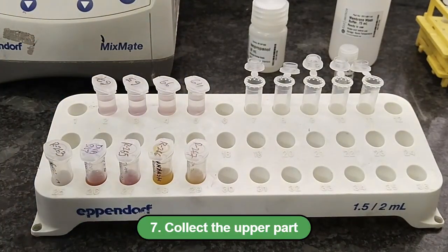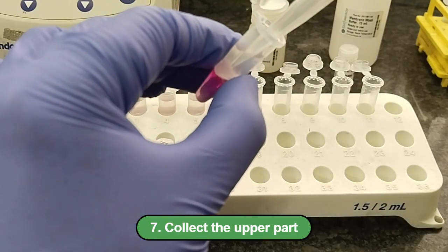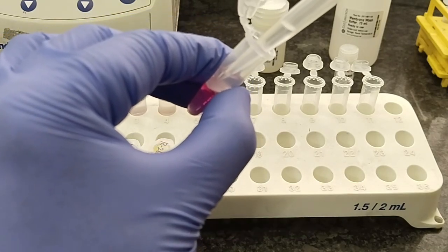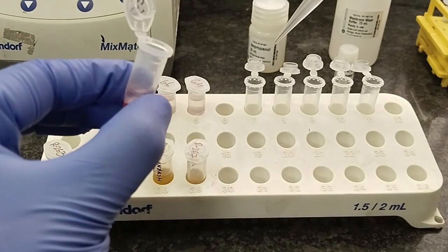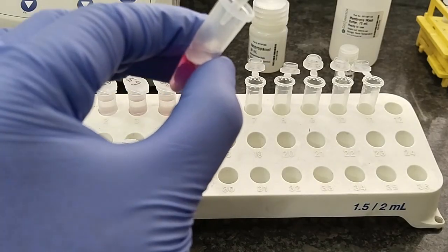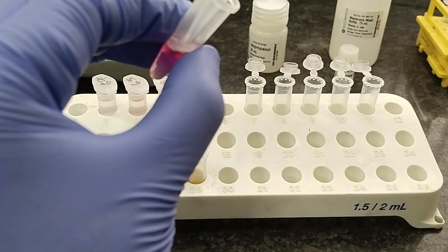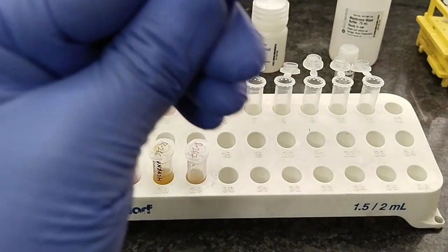Now carefully collect the aqueous phase. Great care should be taken during the collection of the aqueous phase so that no other portion gets aspirated, and put the aqueous phase in a separate tube. So here the aqueous phase is being collected.